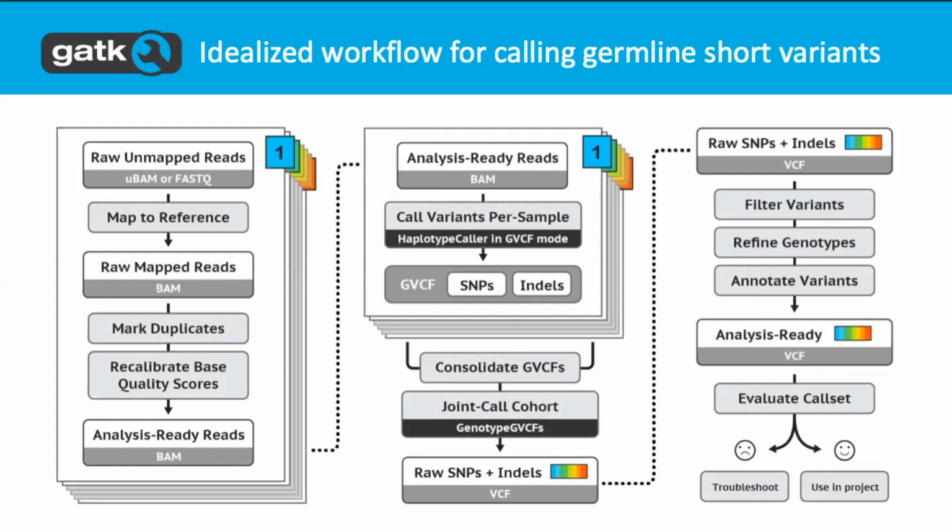I would say that the biggest amount of development for germline short variants is probably around filtering, and also other types of data. Let me talk about filtering first. Most of the variant calling proper is really well understood in terms of the types of errors and problems we encounter. We're capable of making very sensitive call sets.